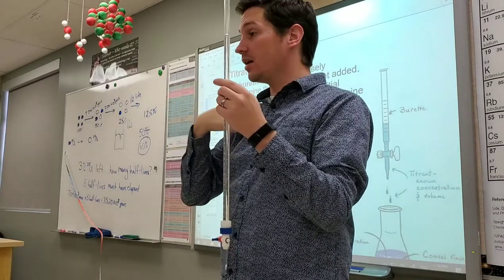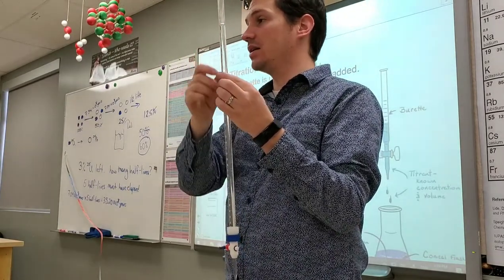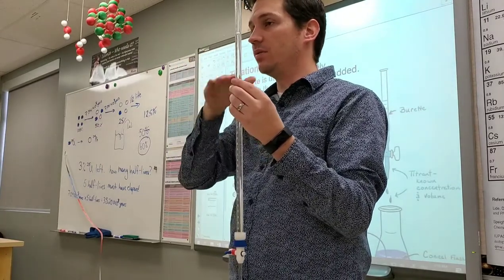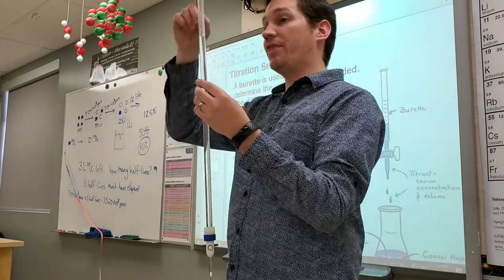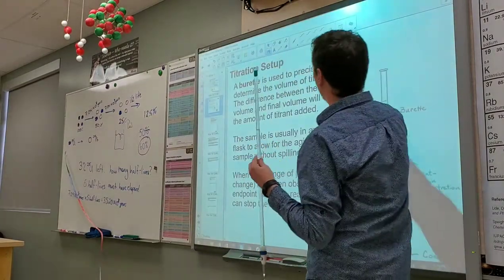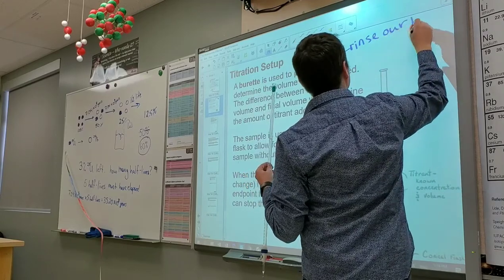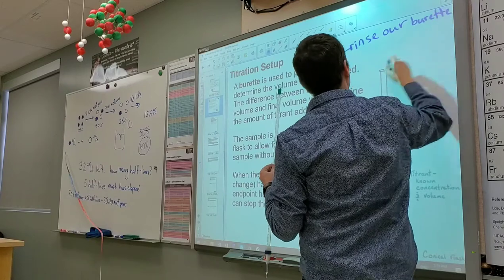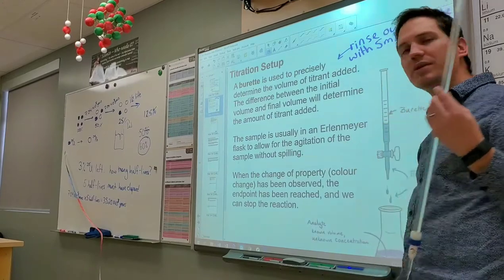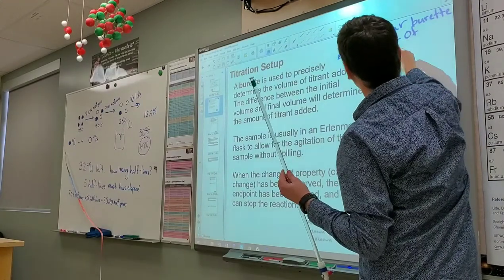So let's say I think that I'm putting 0.1 mole per liter concentration acid in here. But when it reacts with the base, what happens with the concentration of my acid? It'll be reduced, right? So I think I'm putting a certain concentration in here, but I'm not. So what I want you to start thinking about is that we should rinse our burette with like 5 milliliters or 10 milliliters, just a small amount of titrant.